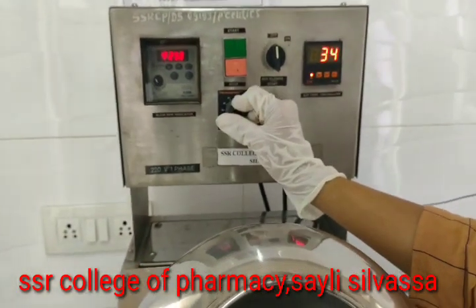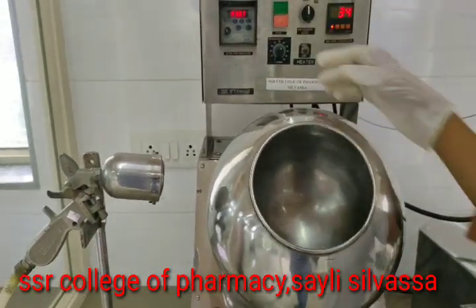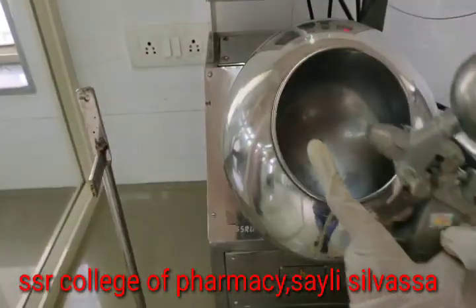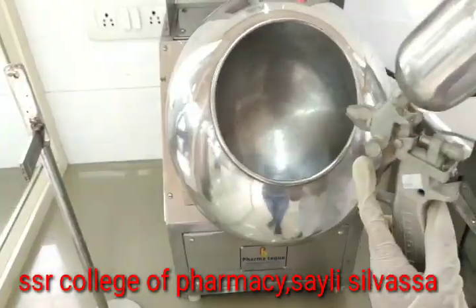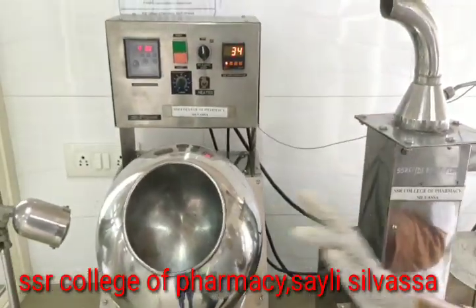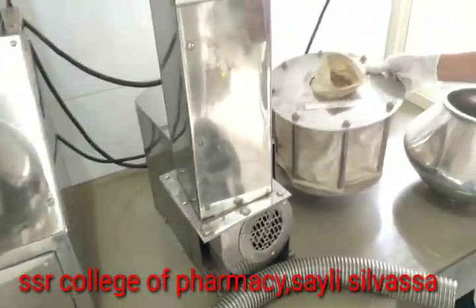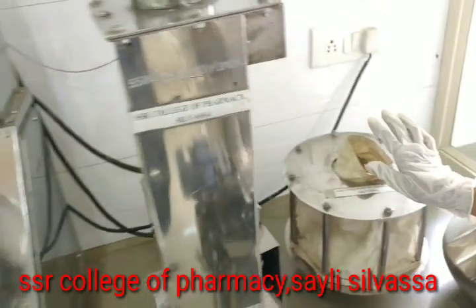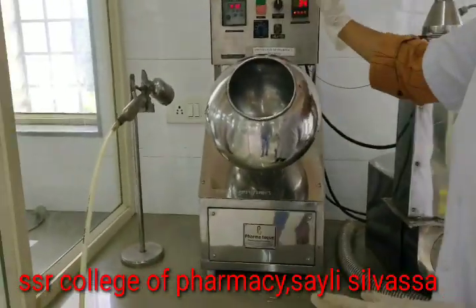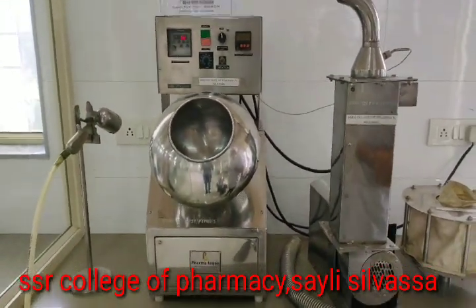We fill the tablets inside the pan, rotate it, and then spray the spraying solution from the nozzle. If required, we can also connect the hot air blower. After coating is done, we move on to polishing by attaching the polishing container. Once polishing is complete, we switch off all the switches and then the main switch. This is how tablet coating and polishing is done.